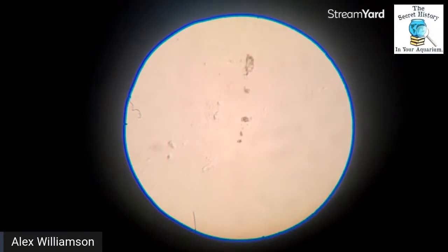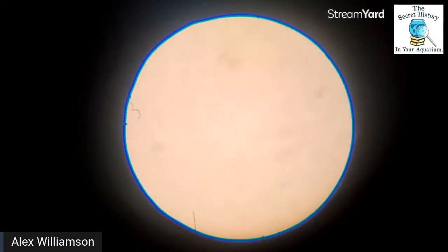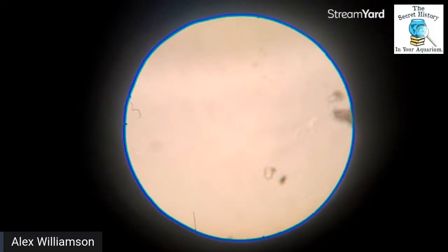All right, so let's look at the last little drop I put on here. There was something in it. There's something that looks like a feather in it that's teeny. It's so hard to move it without shifting the entire everything. Hold on. I don't have a stage mover, which is a bummer. I have to actually move the slide with my finger. I wish I could move the stage smoothly. I wish I had a microscope where that moved for me. All right. So, oh. Where is that thing?